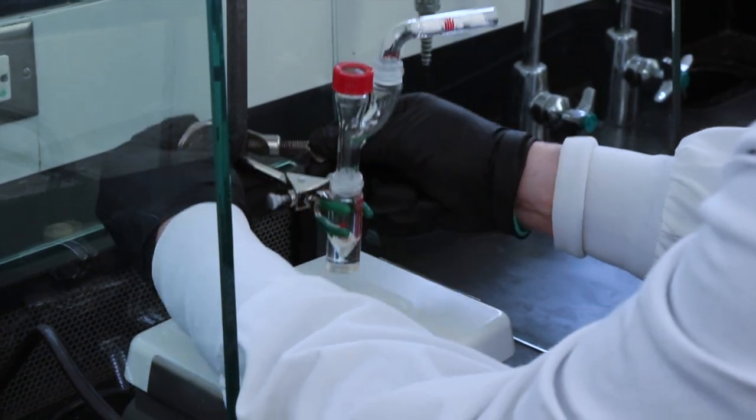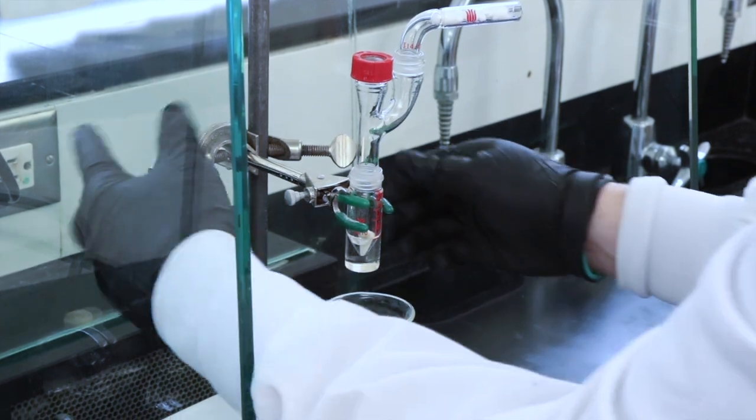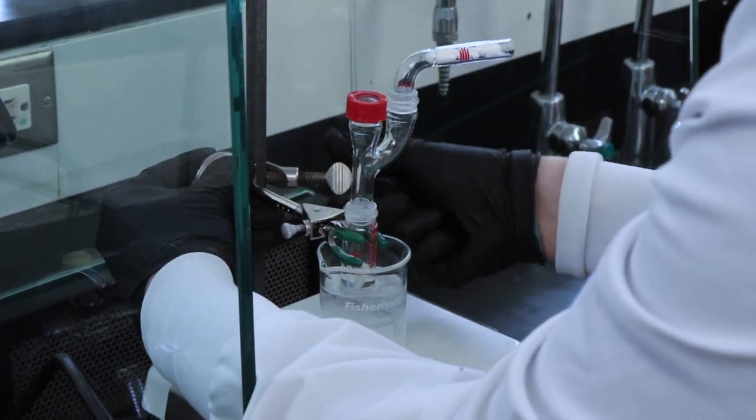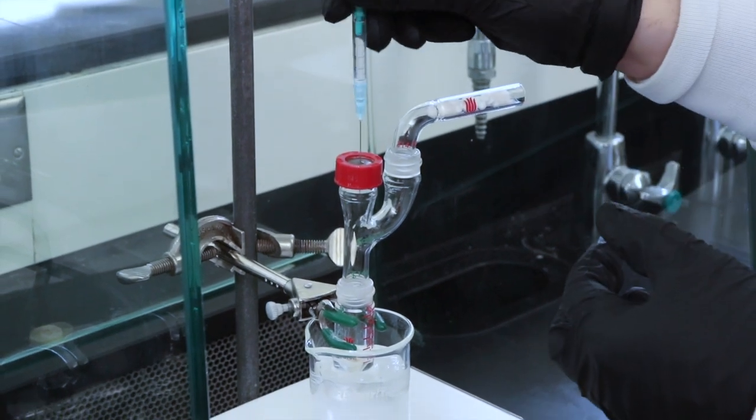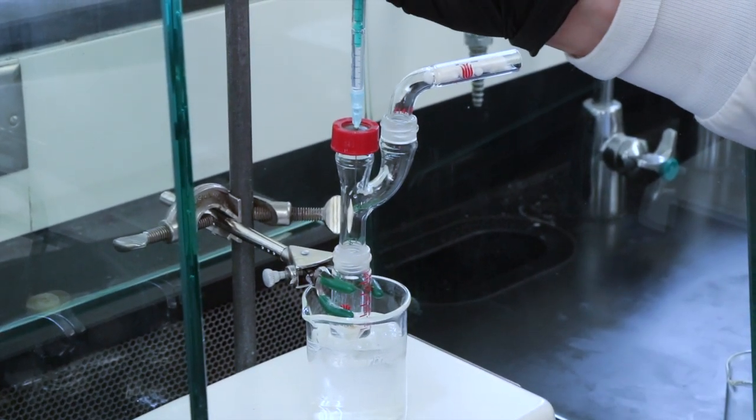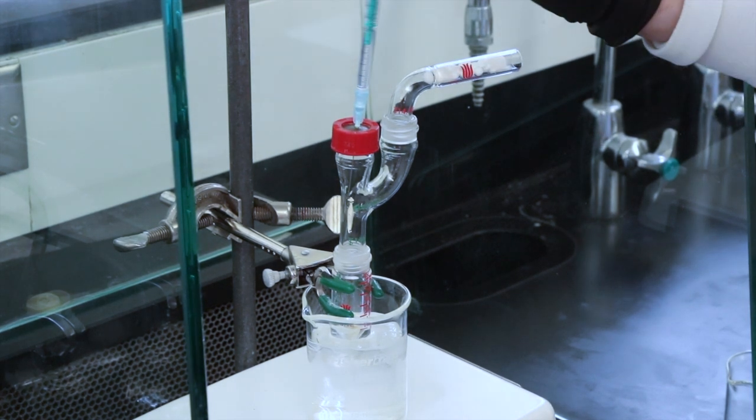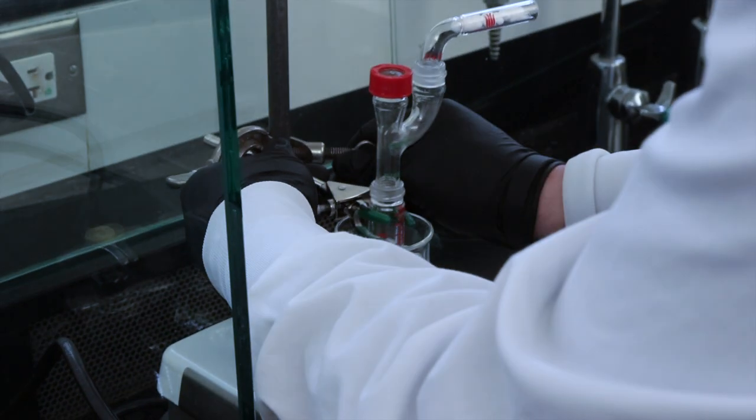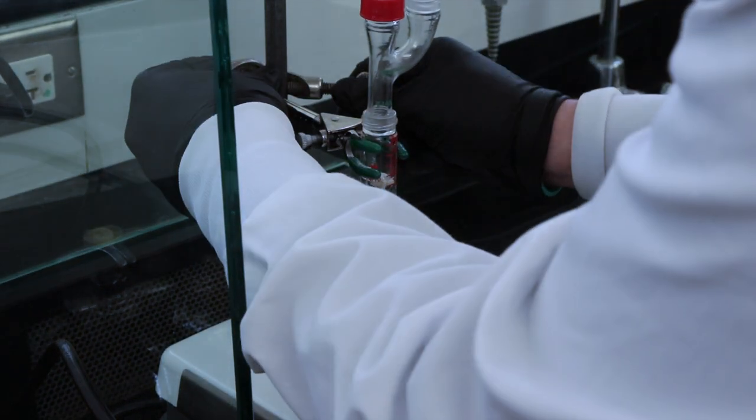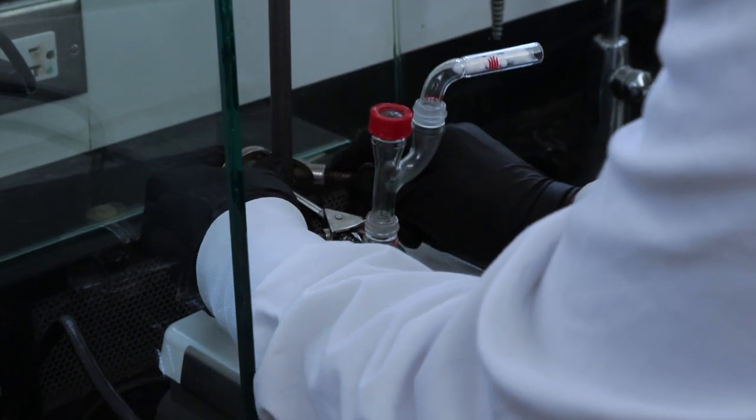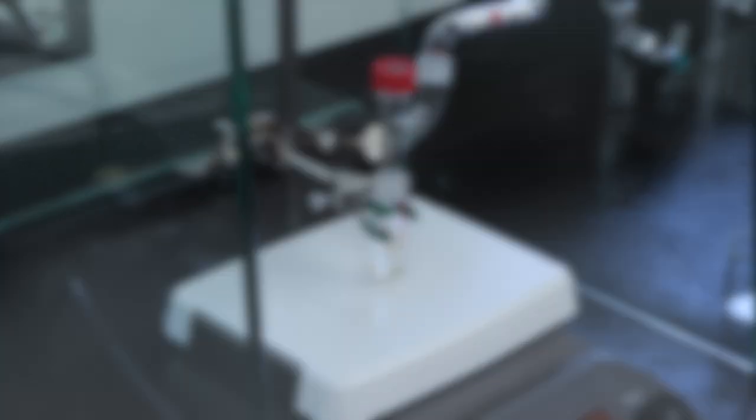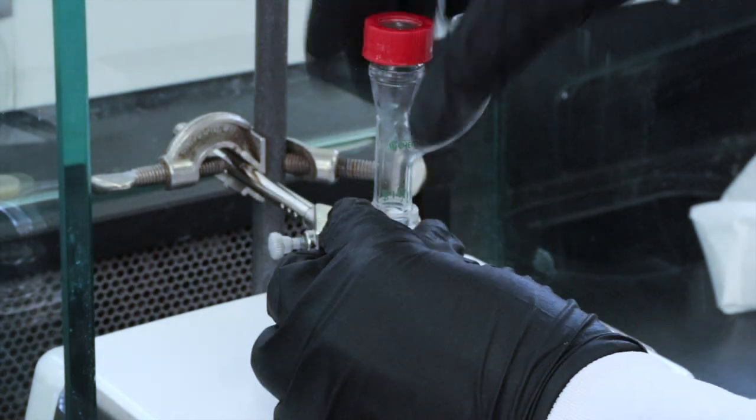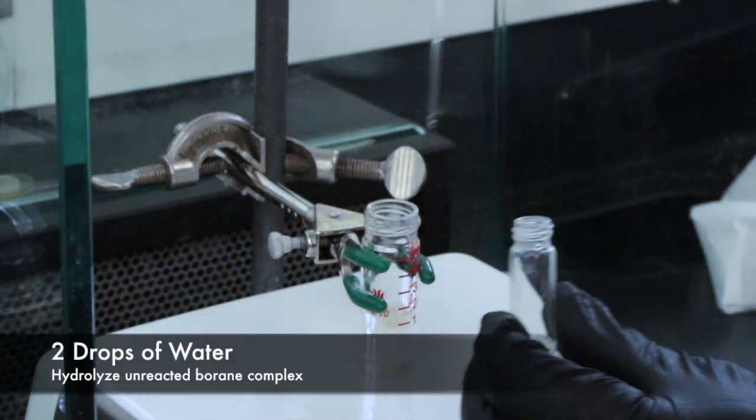Before adding the borane I'm going to be putting the conical vial into an ice bath. Because the borane complex is very reactive we want to control the rate of reaction as much as possible. And I'll also be adding the reagent dropwise over a period of five minutes just so that the energy released from this reaction doesn't cause runaway reactions that we don't want. Once everything has been added I can now take the conical vial out of the ice bath and let the reagents react together for about 45 minutes at room temperature. Once that is done I'll add two drops of water to hydrolyze any unreacted borane and stop the reaction.